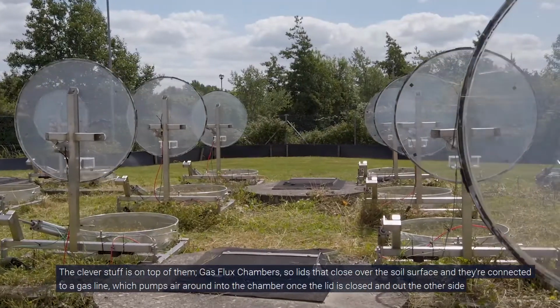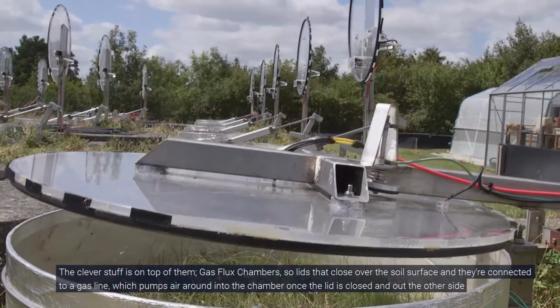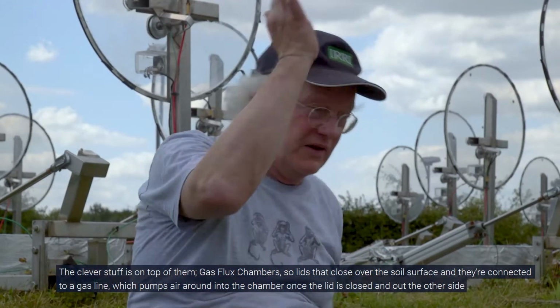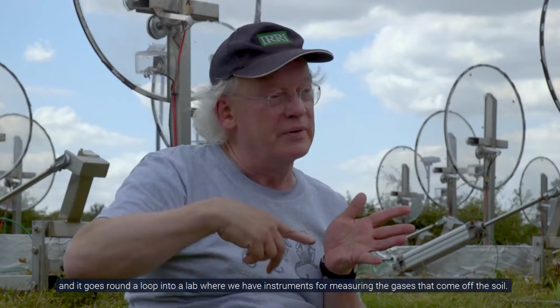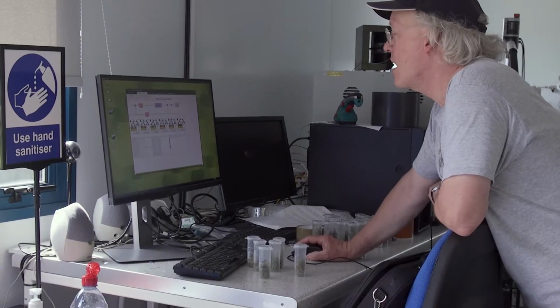And the clever stuff is on top of them, gas flux chambers, so lids that close over the soil surface, and they're connected to a gas line which pumps air around into the chamber once the lid is closed, and out the other side, and it goes around a loop into a lab where we have instruments for measuring the gases that have come off the soil.